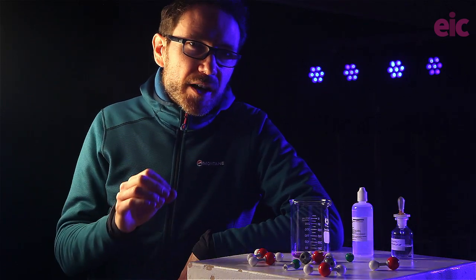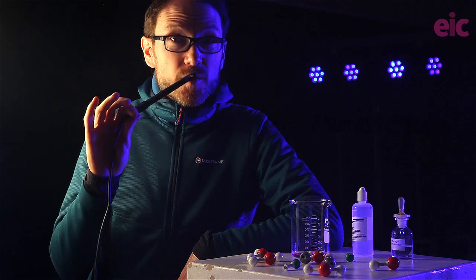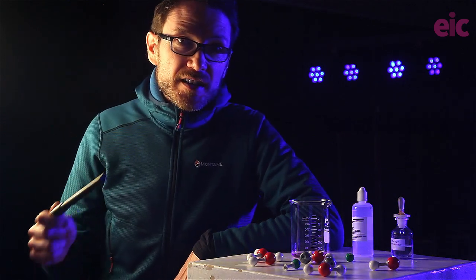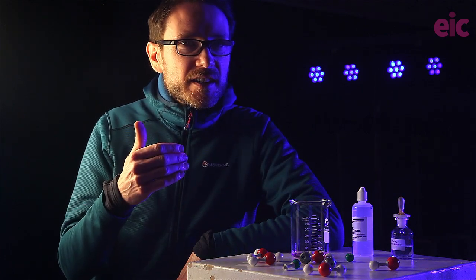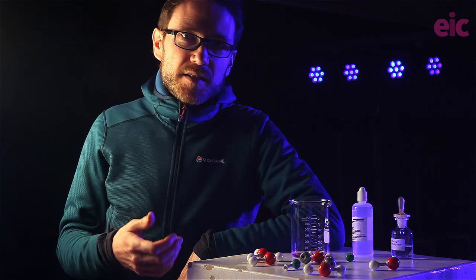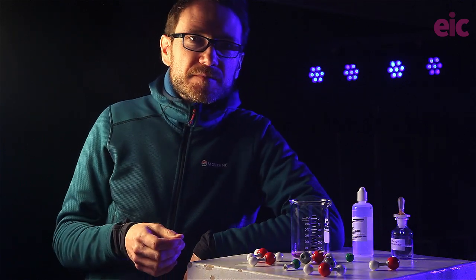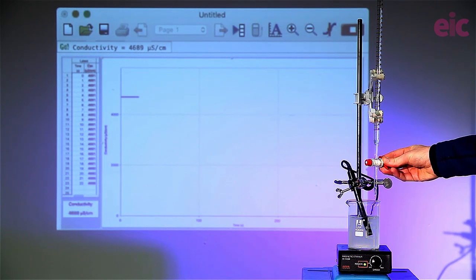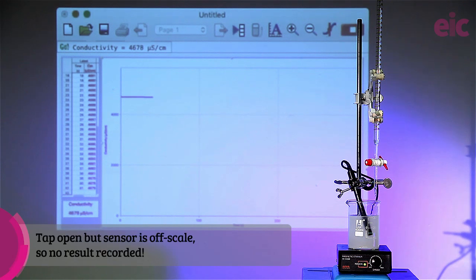I've chosen concentrations for the demonstration so that any of these cheap options will work, because the 10 microsiemen per centimeter resolution is plenty. If you have a little more room in the budget, a data logger probe with 1 microsiemen per centimeter resolution is a worthy investment, as you can produce a graph on screen to analyze. Take all the concentrations described here, divide by 10, and you'll get even better results with solutions that are safer to handle, easier to dispose of, and behave more ideally. Demonstrating the conductivity of the solutions early is also a great opportunity to adjust your meter settings to avoid a false start.